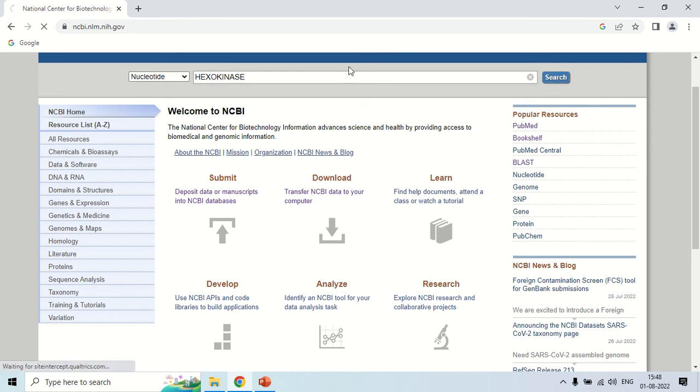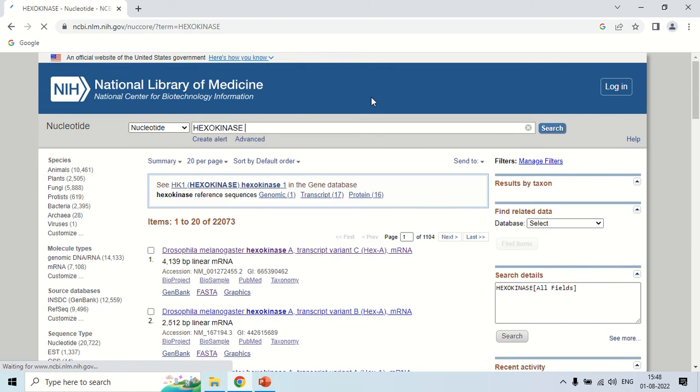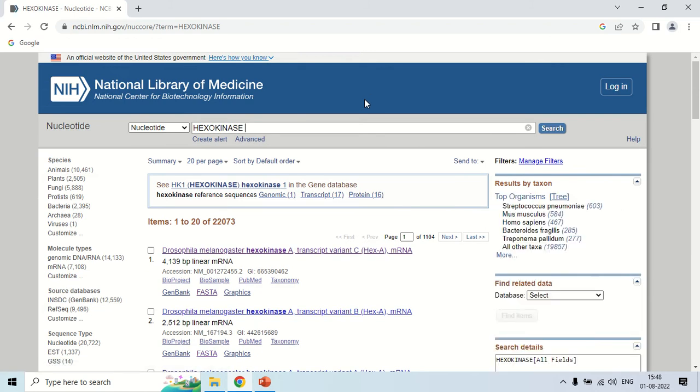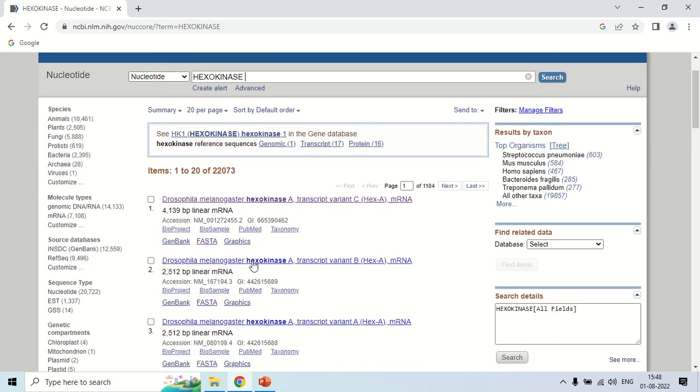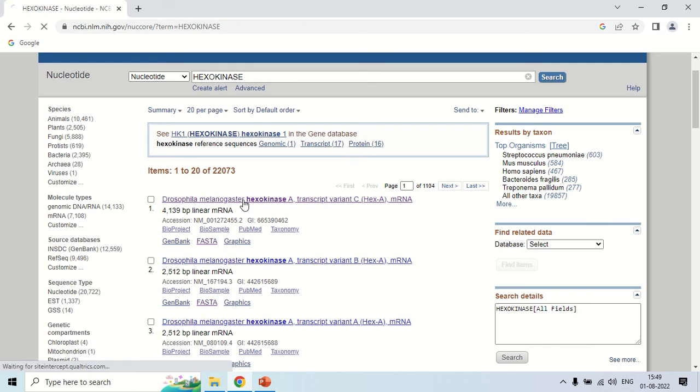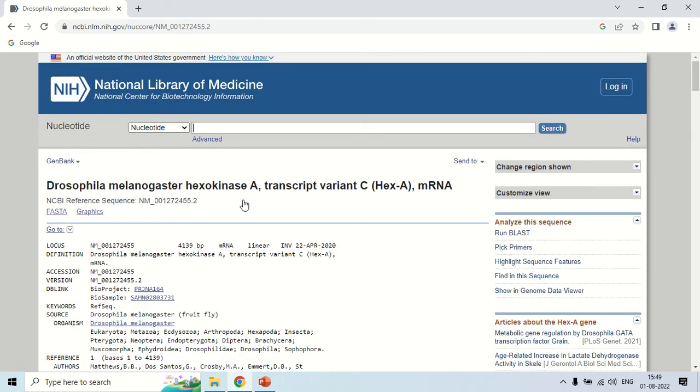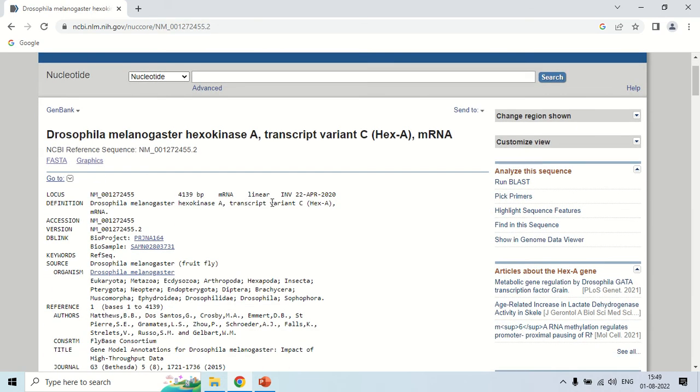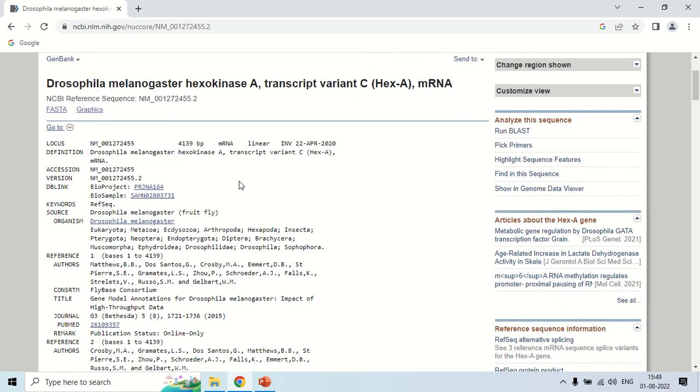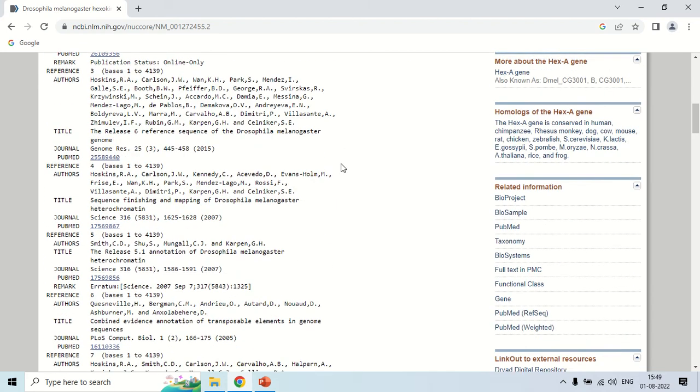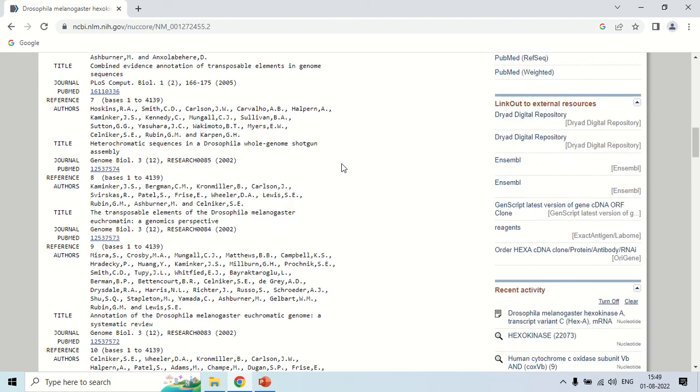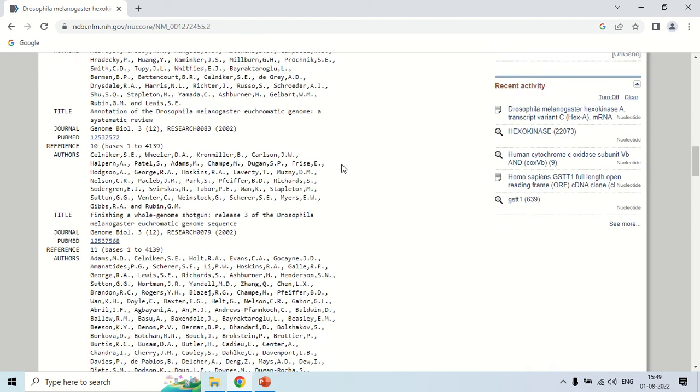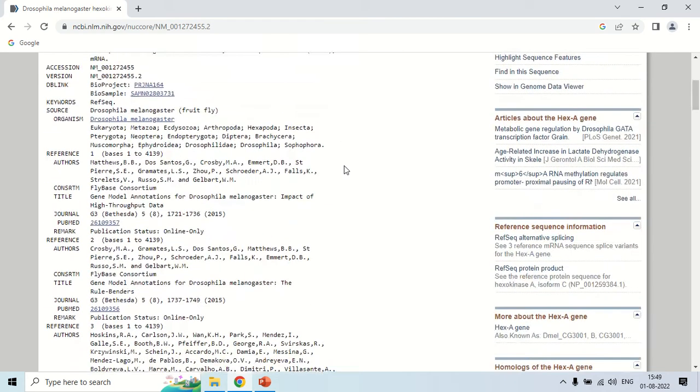Now it will show you the hexokinase gene. These are the organisms in which hexokinase gene is present. You can choose either of them to get the information. As I click here, now the information is in front of us and the database is GenBank. This is the complete information about hexokinase present in Drosophila melanogaster. By this you can get information from the NCBI website.